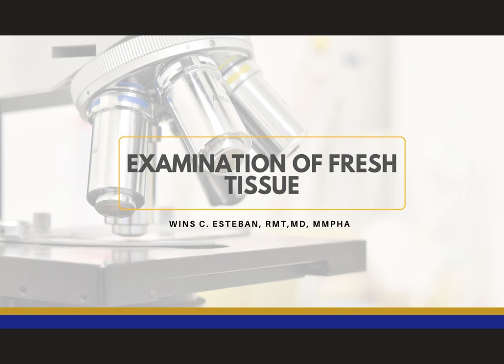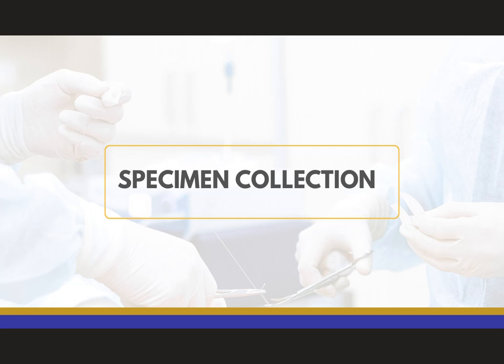So for the first half of our discussion, we are going to talk about different surgical procedures that are usually performed to obtain the specific types of tissues that are submitted to your histology or histopath laboratory for processing. So now let's go to your specimen collection.